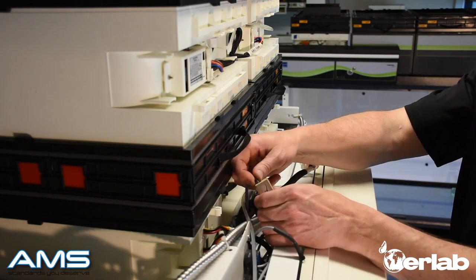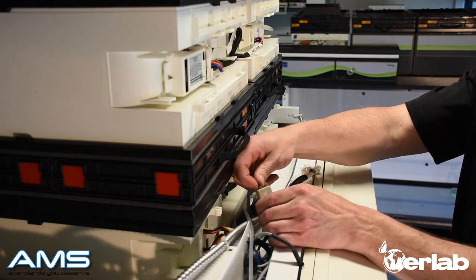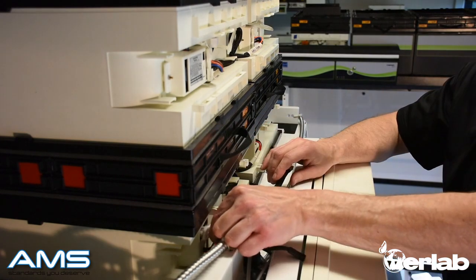Now locate the temperature sensor — it looks kind of like a phone line — and unplug that as well. The final thing to unplug is going to be your light.